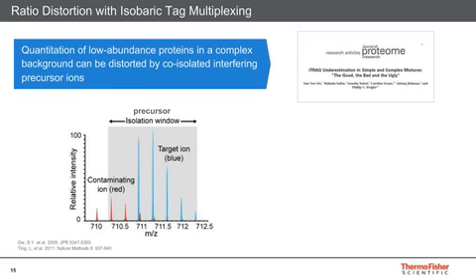The TMT tags can be used to label up to 11 different samples in protein digest. After TMT labeling, samples are equally mixed together before peptide fractionation and LC-MS analysis. Since the tags have the same nominal mass, the labeled peptides appear as one sample during MS, but split into 11 different reporter ions during tandem mass spec for peptide sequencing.